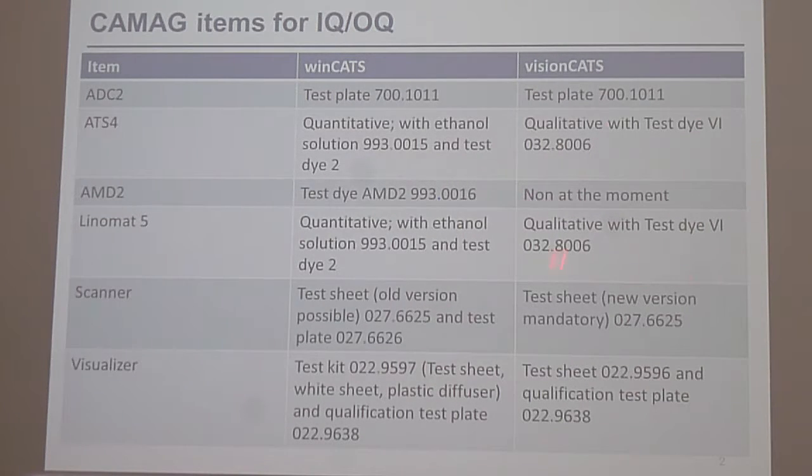We have them now with the test dye 6 here. This is a color dye. This is a food color, so that doesn't make any problems at importing, exporting. It is powder.